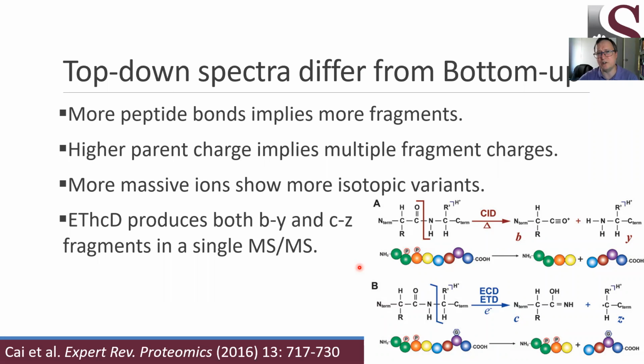Now, if you're familiar with analytical chemistry, I think what's coming next should not be a surprise to you, which is to say that although the mass spectrometry community has become very fixated on accurate mass, knowing to the third decimal place what the exact mass of a fragment ion or a peptide ion is, in this case, we have a problem associated with resolution, which is to say that multiple fragments may appear very, very close together in the spectrum. And being able to distinguish this peak from the next becomes a much more challenging task when the spectrum is this crowded with fragments.